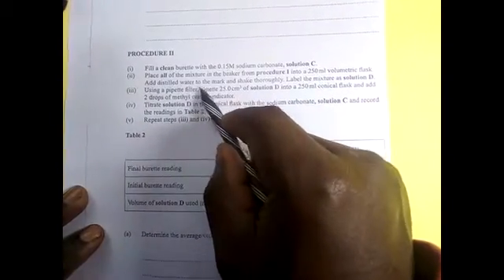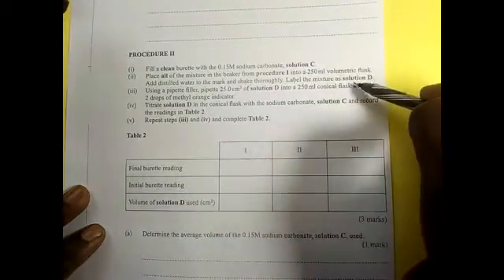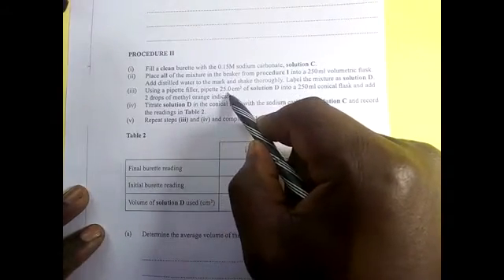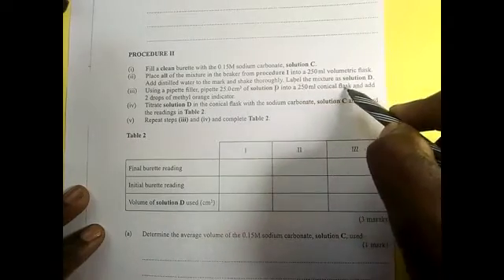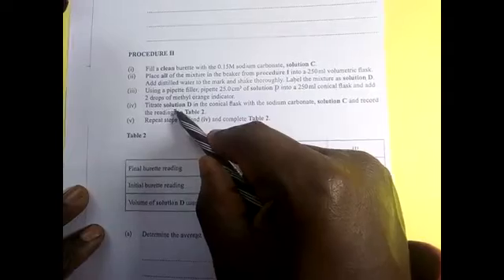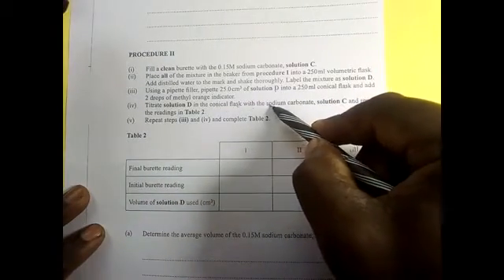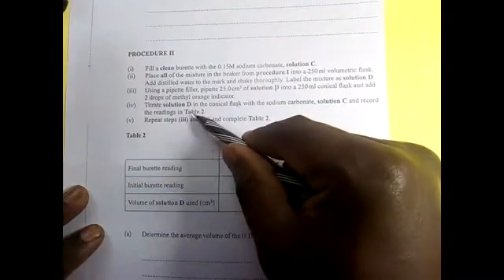Add distilled water to the mark and shake thoroughly. Label the mixture as solution D. Using a pipette filler, pipette 25 cm³ of solution D into a 250 ml conical flask and add 2 drops of methyl orange. Titrate solution D in the conical flask with sodium carbonate, solution C, and record the results in table 2 here below.